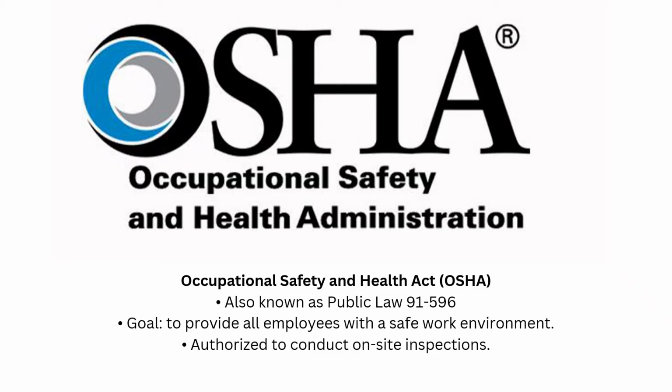OSHA standards also regulate safety in the laboratory, and include laws such as, kindly write this down because I did not place it in my PowerPoint. You write this down. The bloodborne pathogen standard, formaldehyde standard, laboratory standard, the hazard communication standard, respiratory protection standard, air contaminant standard, and personal protective equipment standard.